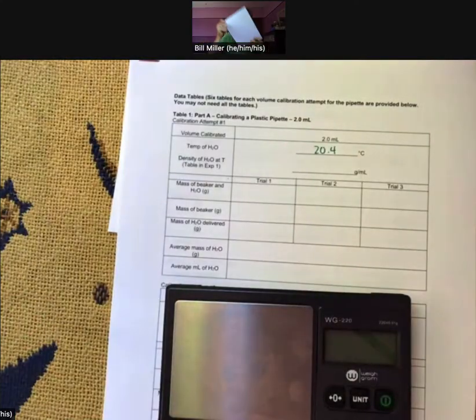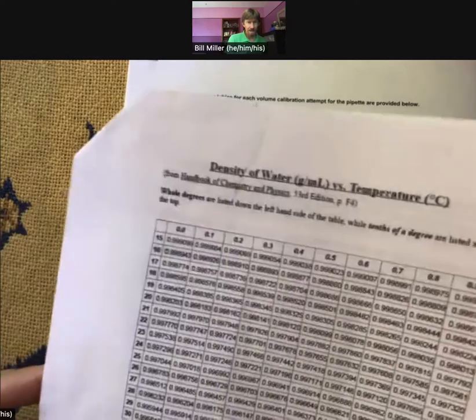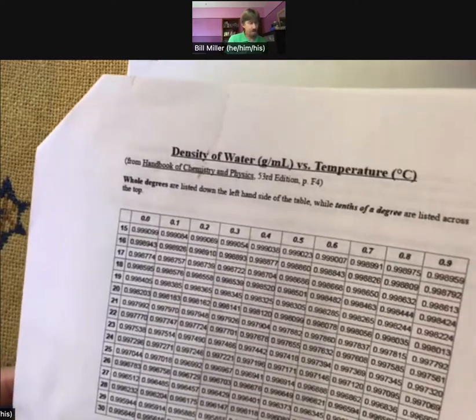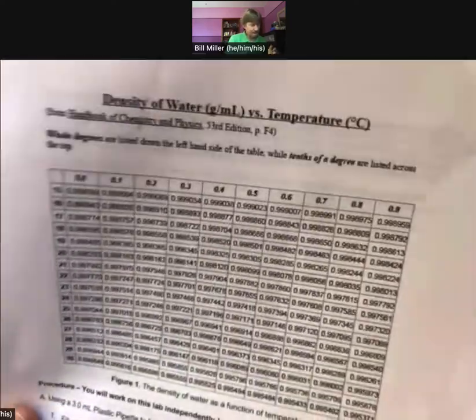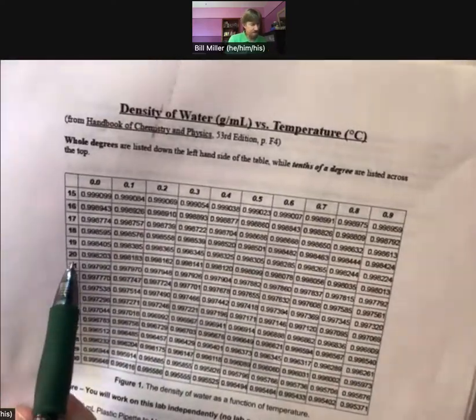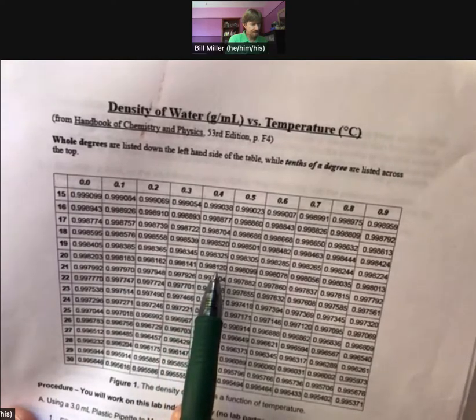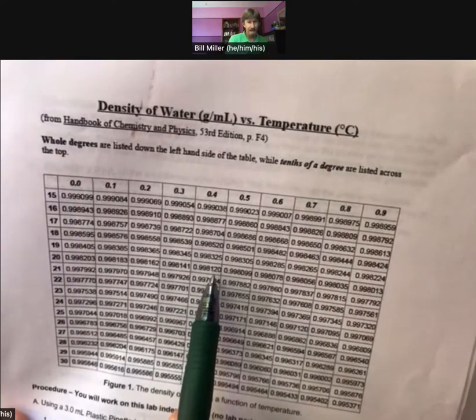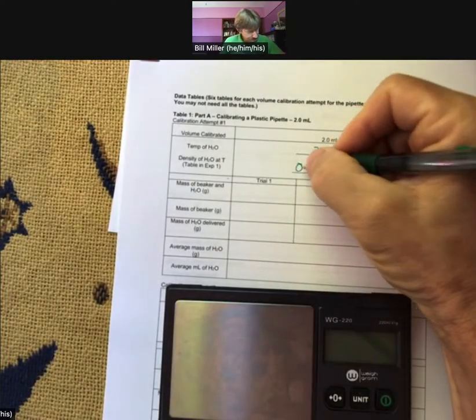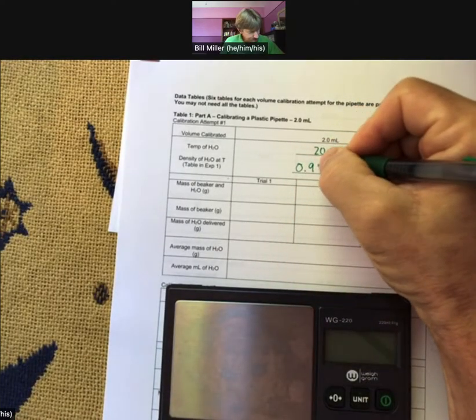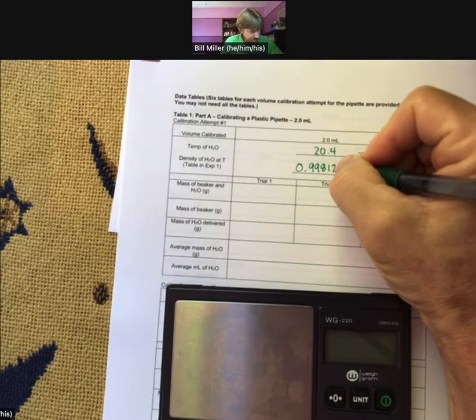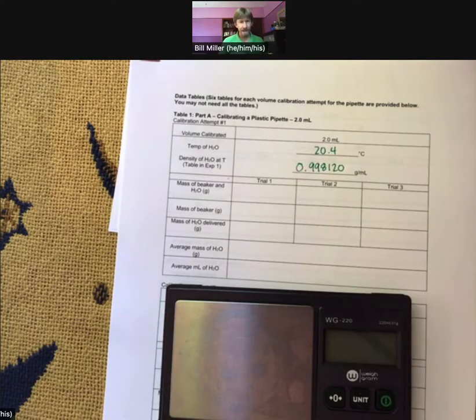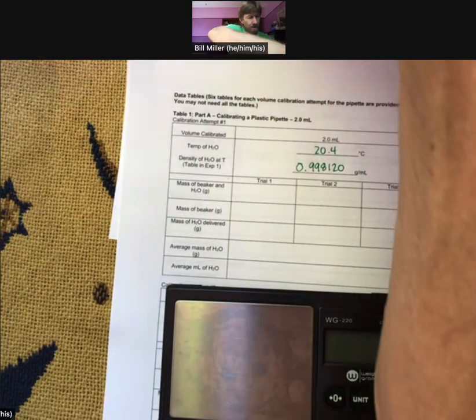I've got the table here from experiment one. At 20.4 degrees Celsius, the density of water is 0.99812 grams per milliliter. I'll put that away for now.